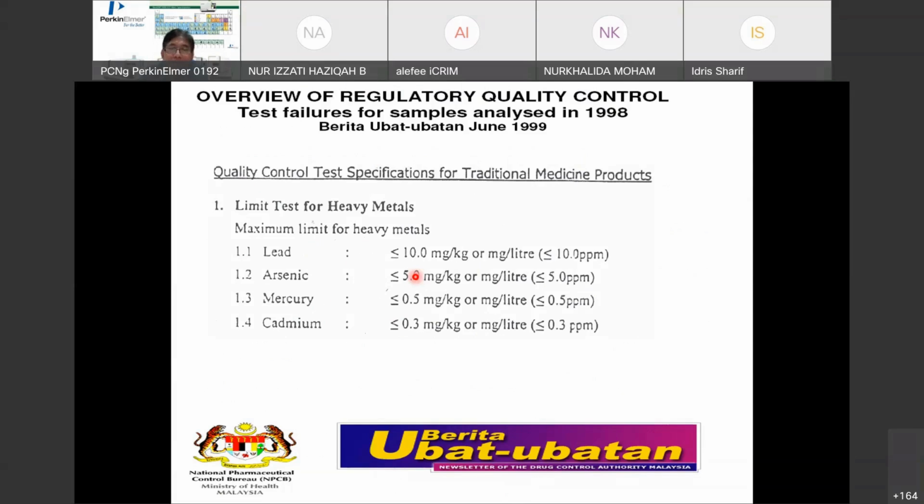Therefore, if this is 0.5 ppm, that is 500 ppb. After 100 times dilution, it goes down to 5 ppb. The first calibration point for the instrument should be 10 times lower, 0.5 ppb. So in this case, the proper and good method will still be ICP-MS.